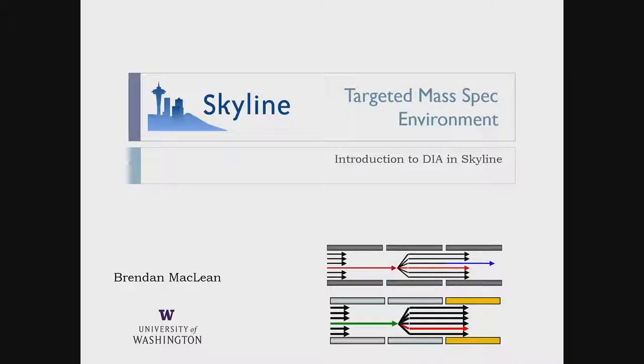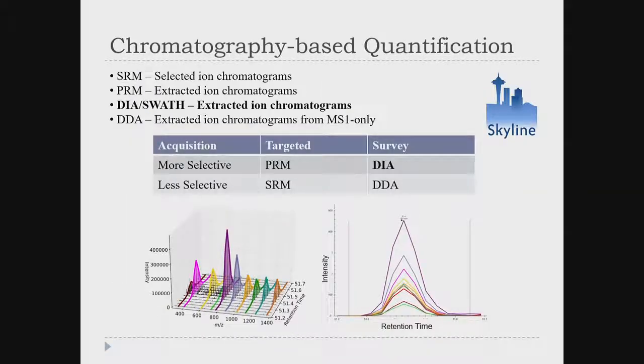Okay, so this morning, everybody who showed up said they'd heard of Skyline, but maybe we high-graded for the people who had heard of Skyline, because why else would you be there? So is there anybody in the room who hasn't heard of Skyline? Okay, well that's great. But I'm going to give you an overview anyway.